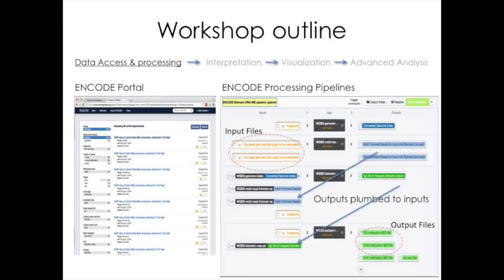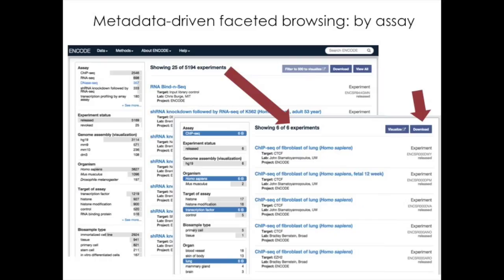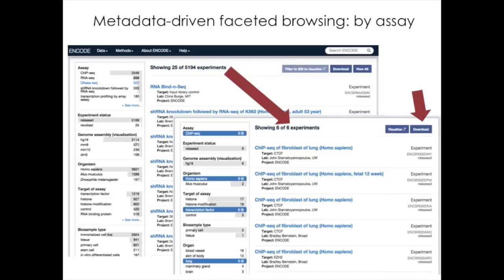So this is called a faceting search, which is basically a way of filtering. So we have large amounts of metadata, very rich, hundreds of fields that are available for each experiment. And what we've done on the site is create these facets, sort of pre-computed filters that you can do. So if you click on these numbers there, like on a shopping site, you reduce the total number of matches as you go forward. And so in this example here, we've clicked it down to a smaller set. So there's only six experiments at this point. At any point along the way, you can click on the download button. It doesn't actually download the files immediately. It gives you the URLs that you can use to retrieve those files, because you may have many hundreds of thousands. You probably don't necessarily want to download those files to your Mac or whatever. With the URLs, you can take that and download it from any command line. We also give you a short summary of the metadata associated with those files. There is also a visualize button, and you can use track hubs to the Santa Cruz browser to actually display these particular experimental results on the Santa Cruz browser as well.